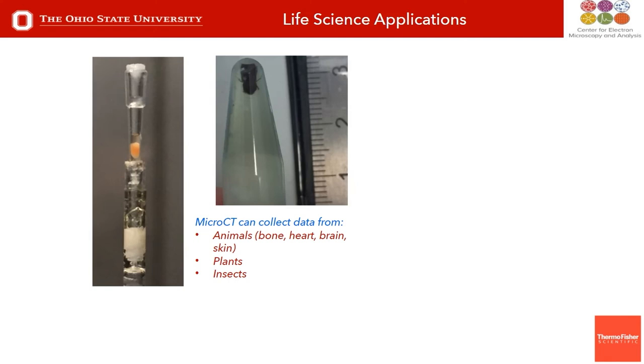Another life science application, well, you can use this for many life science applications, I should say. One thing I'd point out on this slide is that these are photographs of actual samples going into the microscope or into the CT. Note that the sample preparation doesn't look too crazy. We have a little sample in a cylinder here on the left. In the middle here, we have a little bug.